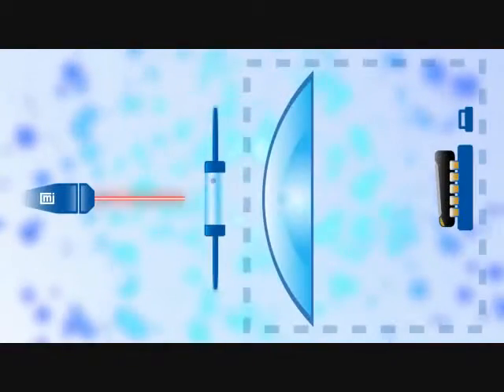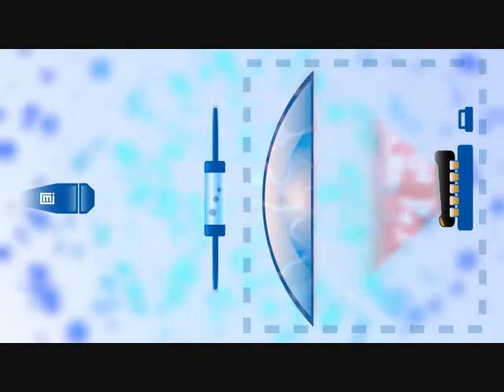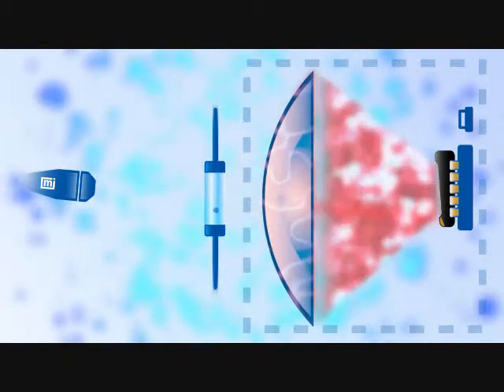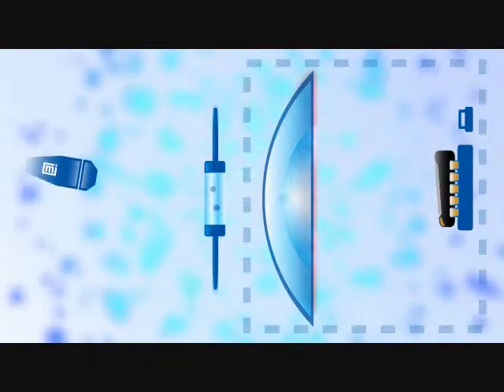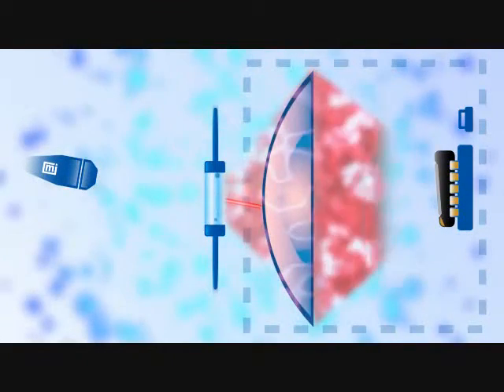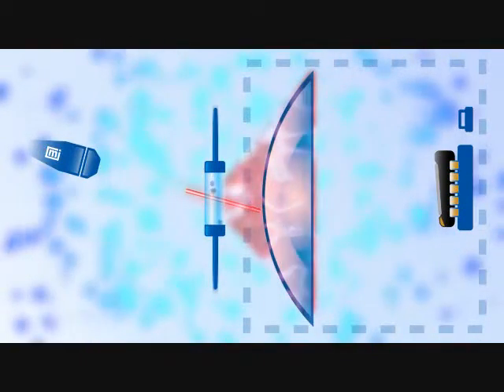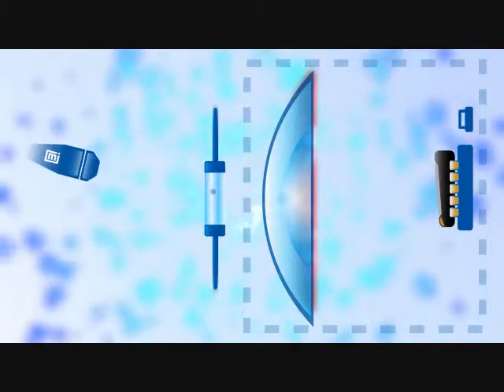Laser diffraction, or static light scattering. The most common particle sizing technique determines particle size distribution by capturing scattered light data with optical properties of particles in a liquid medium. This type of analysis is best suited for fast result generation to make decisions on the quality of a manufacturing process.